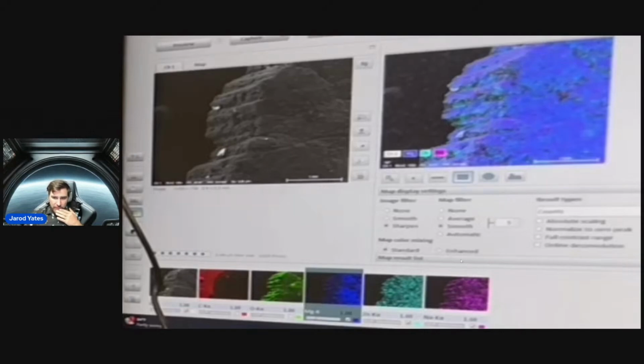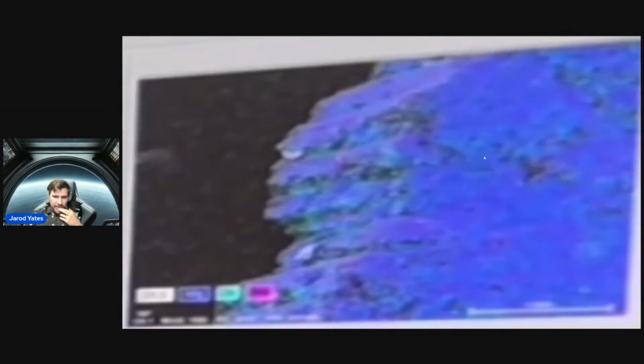Here is another image that I took of that. So in this case, pink is your sodium rather than bismuth like it was in previous images. For this particular image, this here is your sodium. And you can kind of see in this super blurry zoomed in cell phone shot that, yeah, it looks like there might have been some detection of that. Here's zoomed in even further and even blurrier. Sorry, folks, this is the best I could do with the materials we got for recording.